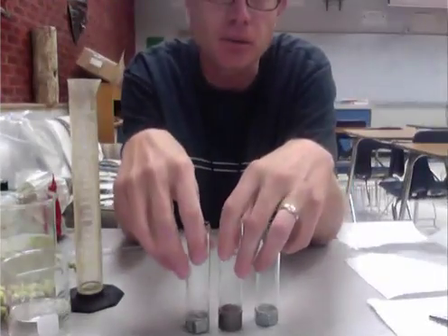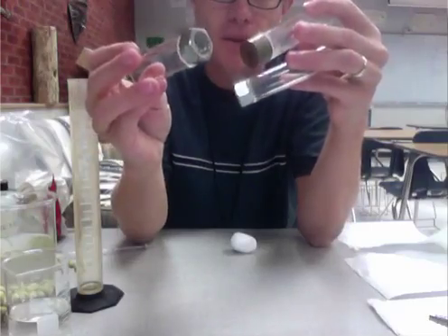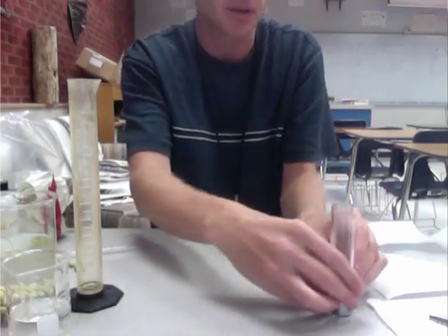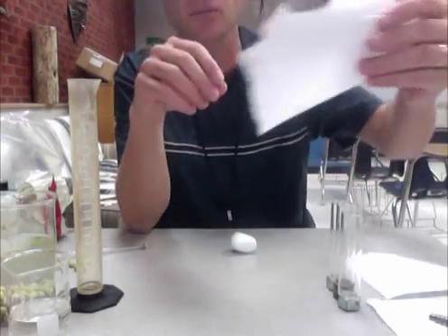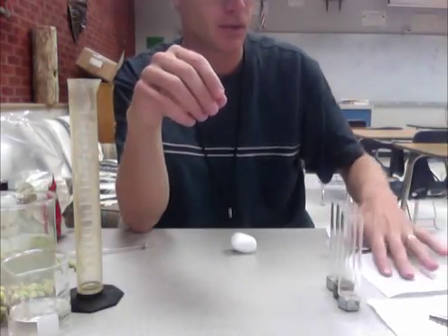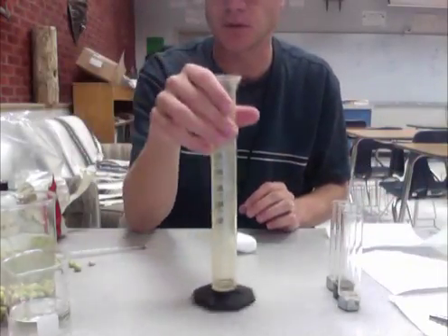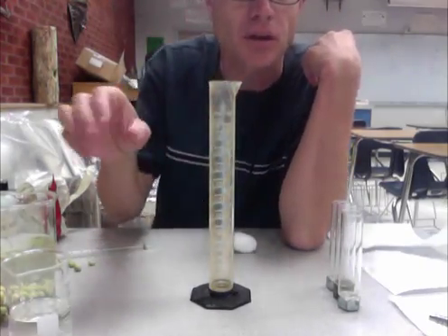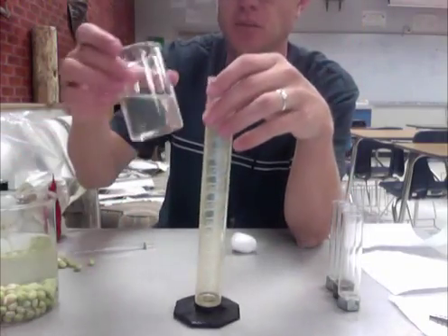Step one: obtain three vials with steel washers on the bottom. I also have three little bits of paper towel that we'll use in just a second. Next, we're going to fill a 100 milliliter graduated cylinder with approximately 50 mils of water.